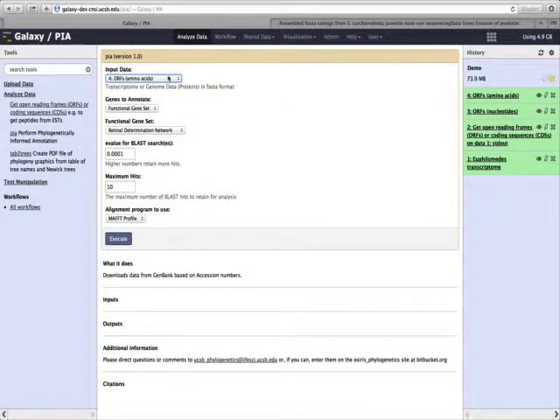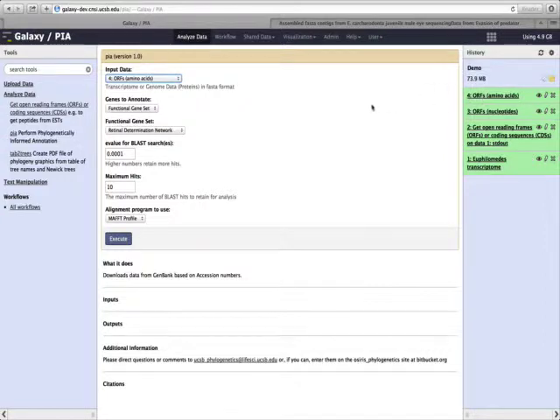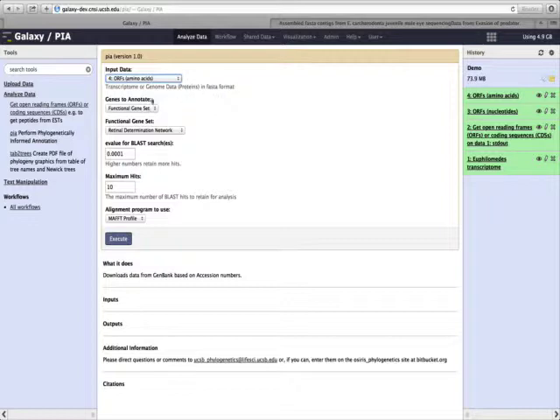First, we need to specify what our input data is. We want to use amino acids, and that is our file in our history, number four, which are the open reading frames from our transcriptome data.